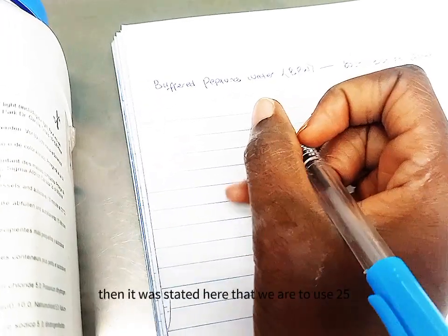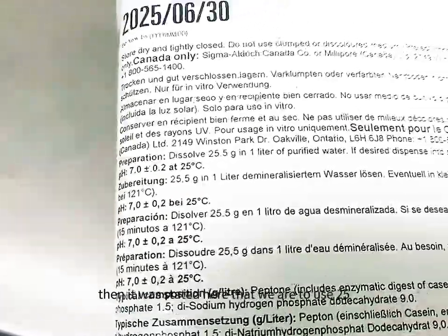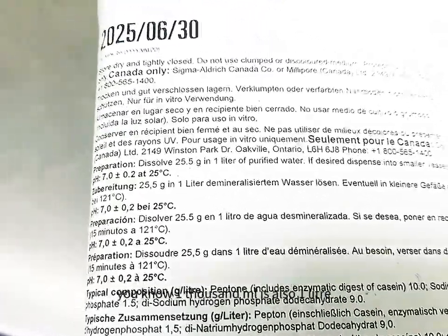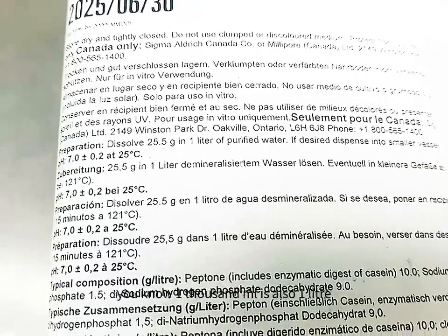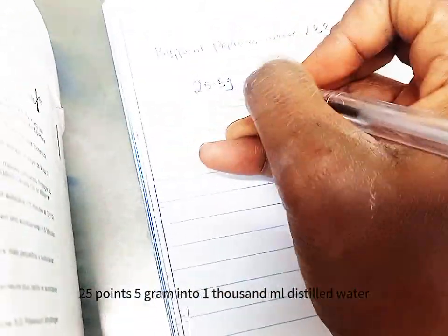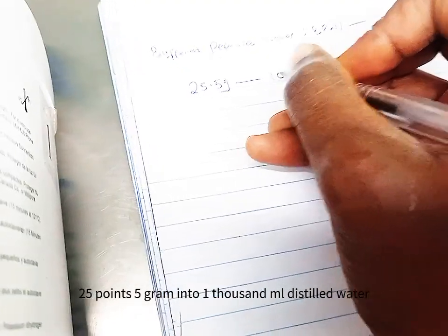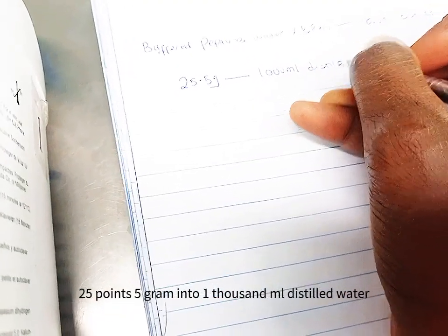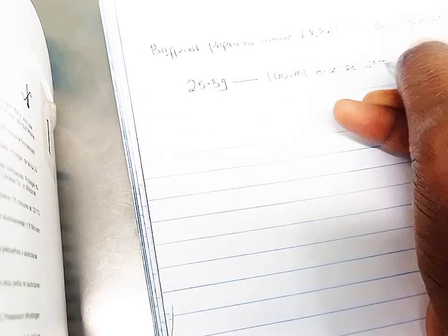Then it was stated here that we are to use 25.5 gram into 1000 ml. You know 1000 ml is also 1 liter. So I'll come here and write 25.5 gram into 1000 ml distilled water.